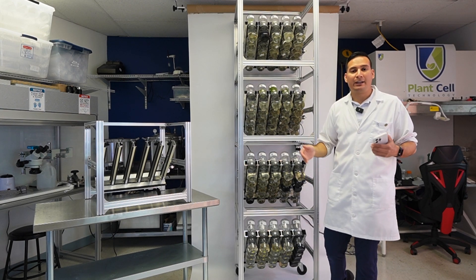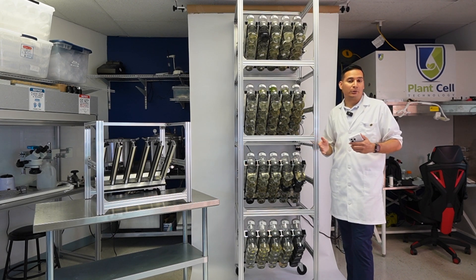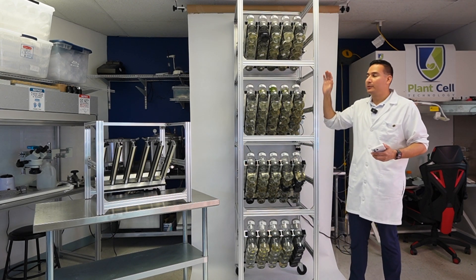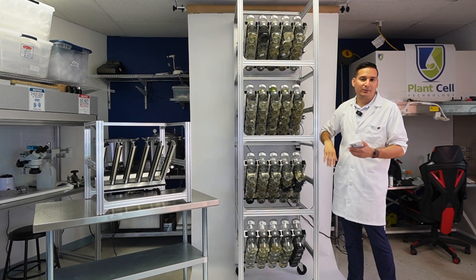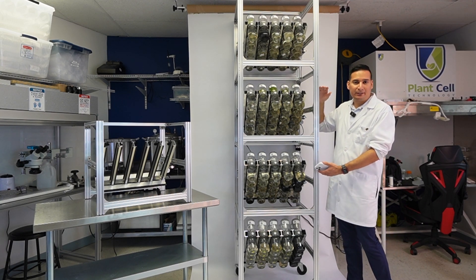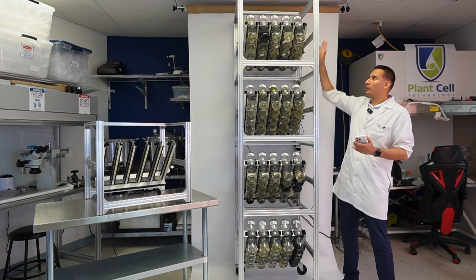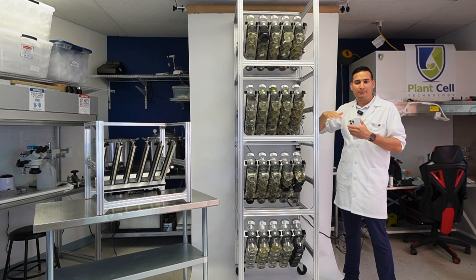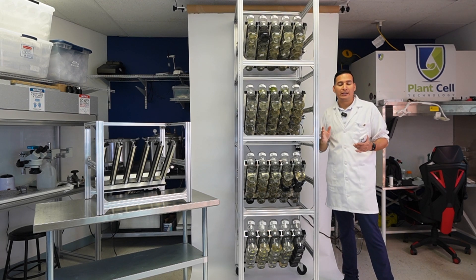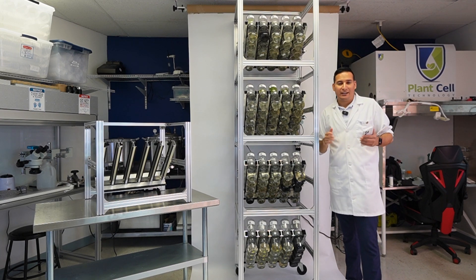I can flip all four units at the same time if I want, or I can set the top two to flip every six hours and the bottom two to flip every 12 hours. We have that flexibility — if some plants need more frequent immersions you can do that, and if others need less, you can configure each group independently based on your plants' needs.